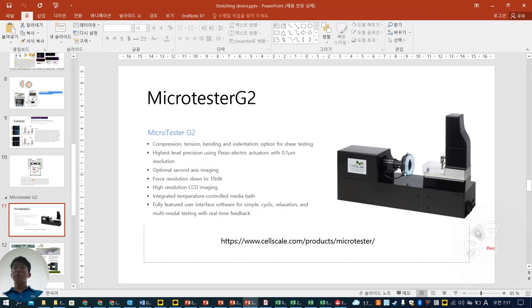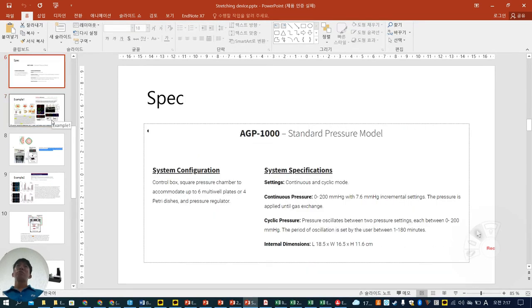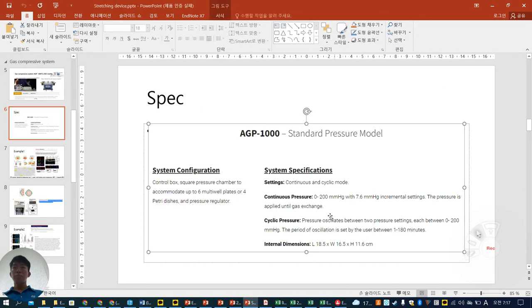So their feature is like that. So this is 잠깐만 아까 위에 거 같은 경우는 그 최열의 인베딩에서 3차원에서도 할 수가 다 볼 수 있죠. 네. 일단 하이드로젤 내 인베딩 해놓고 가스로 누르는 거니까 그 사이클링도 된다니까. 사이클링은 어떻게 되지? 저기서 레귤레이터가 좀 심플한데 컴퓨터로 조정하는 게 아니고 아날로그 방식으로 조정하는. 네. 프레스 해가지고 올리고 내리고 그쵸. 옛날에 그 퍼니스처럼 하는 거 같아요. 컨트롤러가 좀 크루드 할 수도 있는데 사이클링을 어떻게 하는지 모르겠네요.